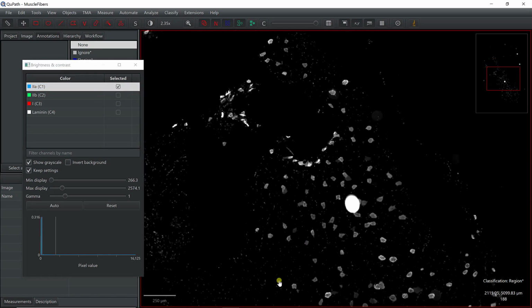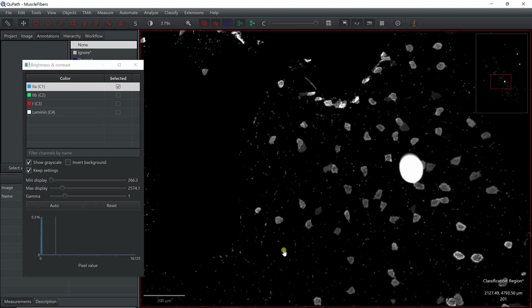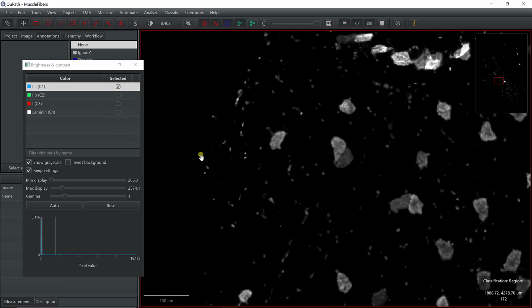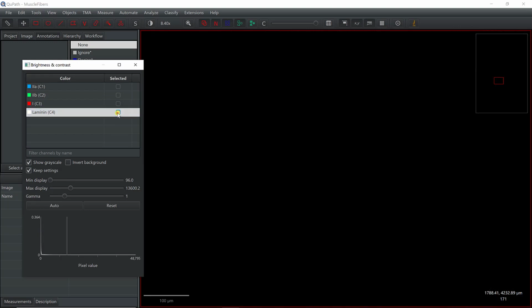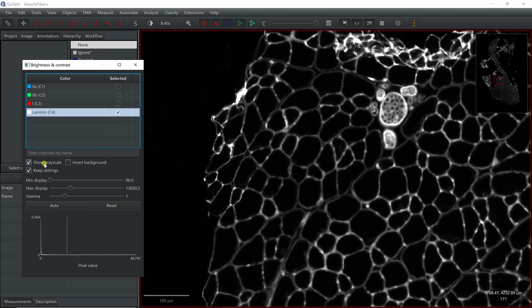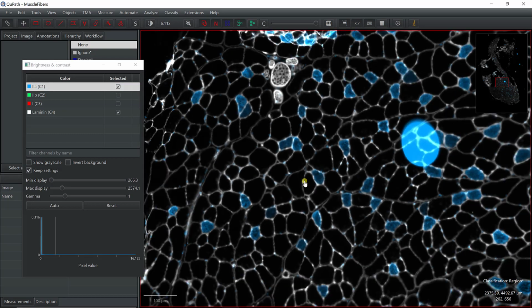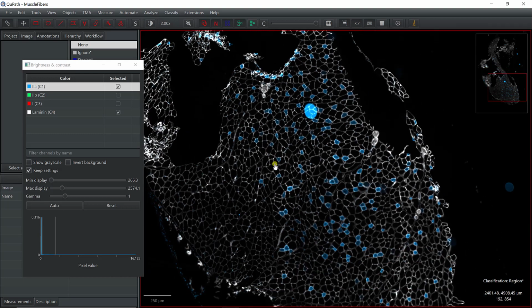And as you can see, you have fluorescence in the background, which is not specific to fibers, but that shouldn't be a problem because fluorescence that is within the muscle fibers really has the shape of the muscle fibers, while these other ones are just spurious, probably at the junction between fibers. I'm going to have to remove the grayscale and see both of them. So you see it's on the laminin, but it should be fine to actually segment my fibers.